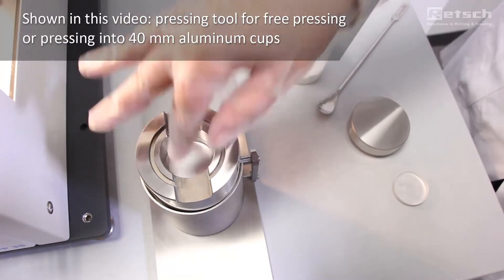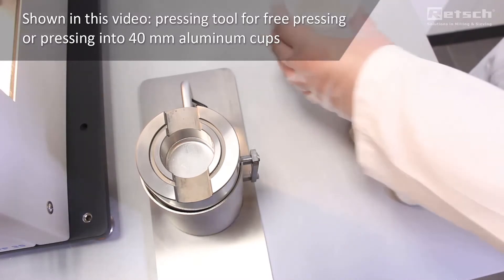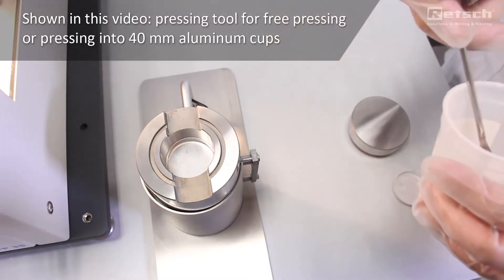Four different pressing tools can be used with the one PP35 model. Please visit our webpage for detailed information.